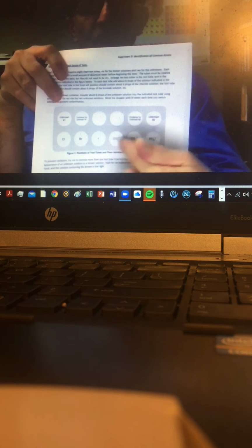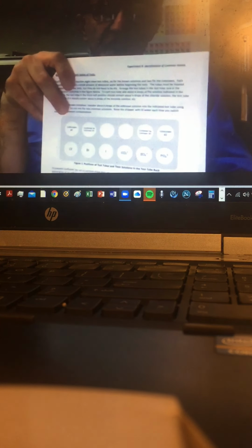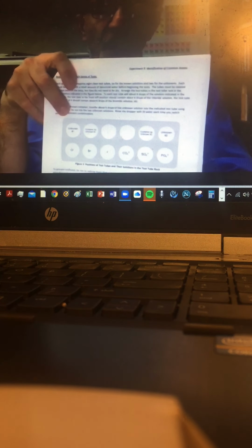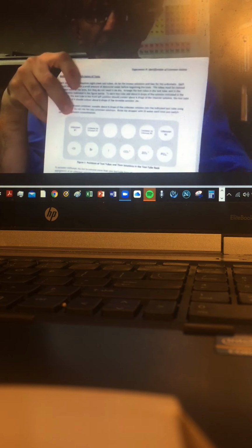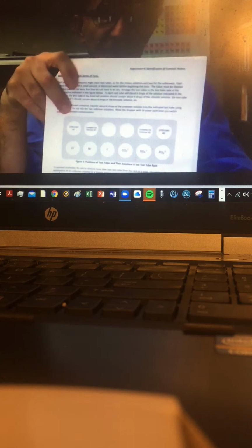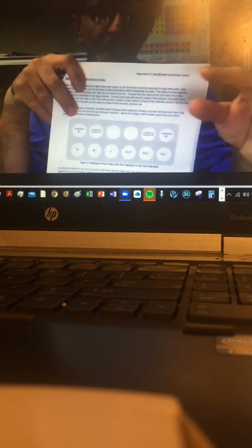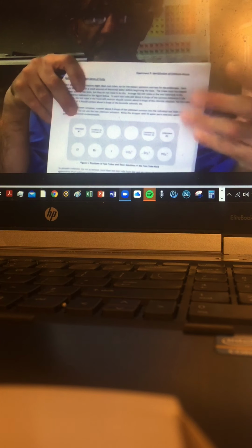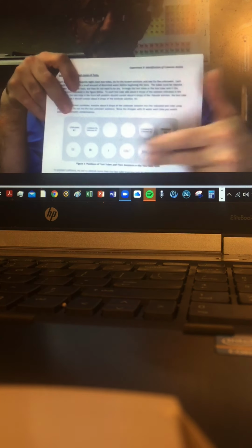Okay, so we've got carbonate, sulfate, phosphate. It is specific to the sulfate. It produces a precipitate. But how would you tell the other two, the carbonate and the phosphate? By qualitative analysis, by looking at the solution and what develops in the solution. So hopefully you'll be able to tell the difference.